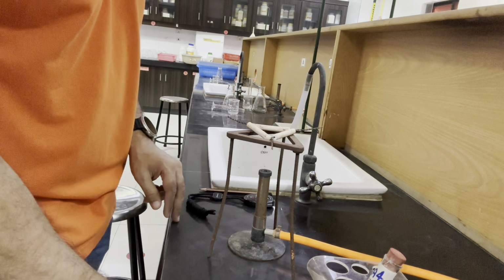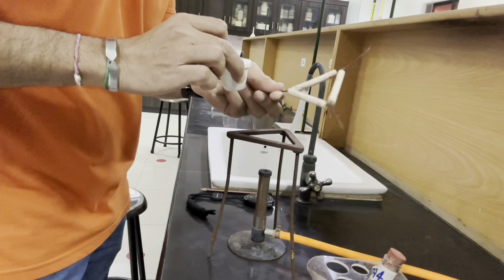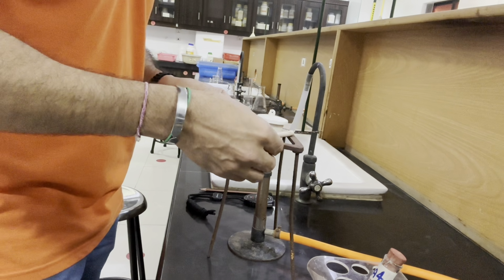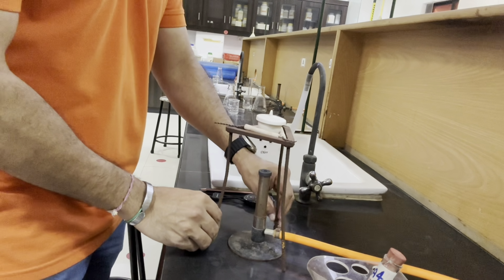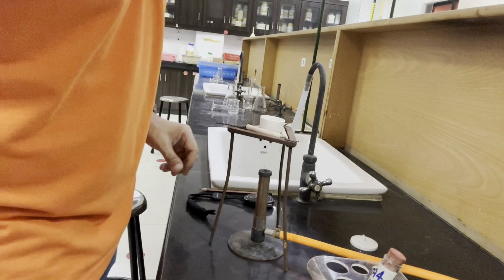Now let's support this crucible on a pipe clay triangle like this first. Then place this triangle correctly on this tripod stand and then remove the lid and start heating for 1 minute.